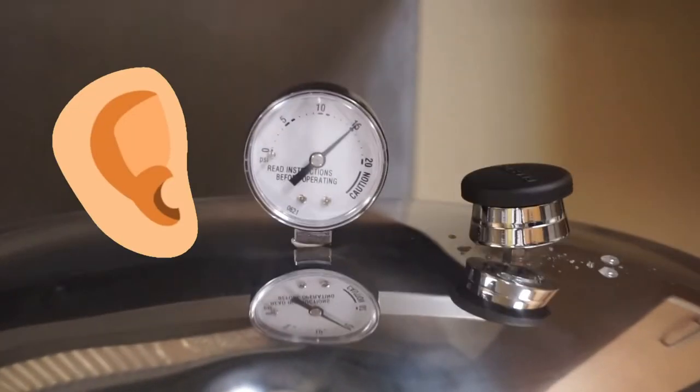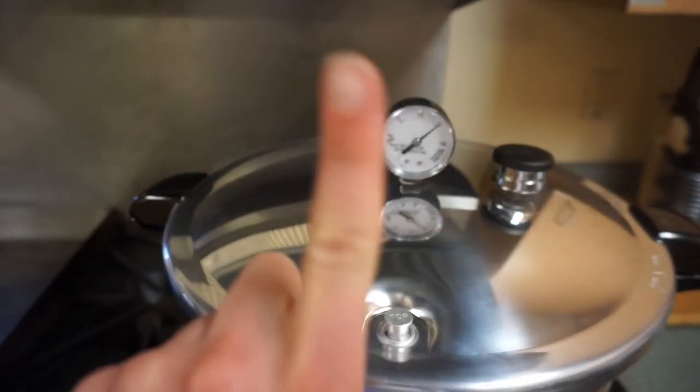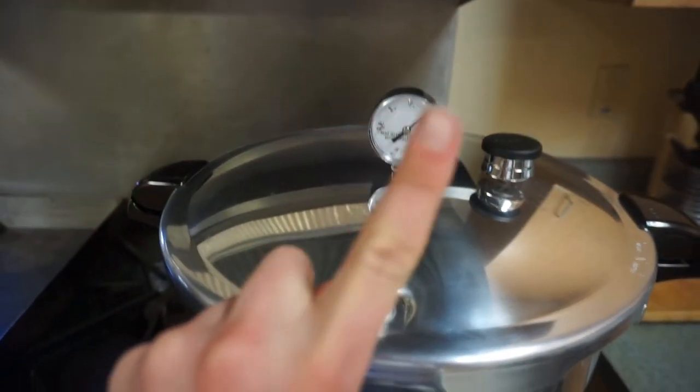Stay within earshot of the pressure cooker to ensure the pressure regulator is rattling. Turn off the heat when done. Wait for the pressure to drop to zero psi. Do not open until pressure has dropped to zero, and remove the bottle when cool enough to handle but still warm enough to remain a liquid.